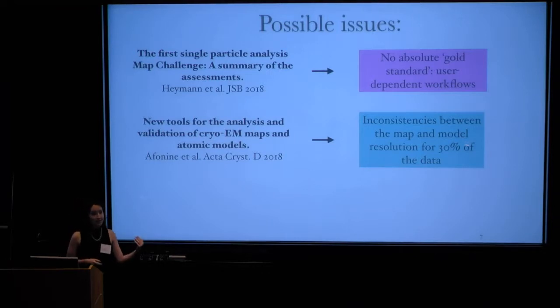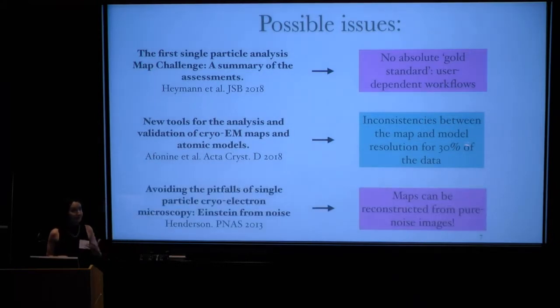Inconsistencies have been found between the resolution reported in the map and the resolution reported in the model for about 30% of the reported data. And also, it has been typically known in this community that maps can be reconstructed from pure noise particles.